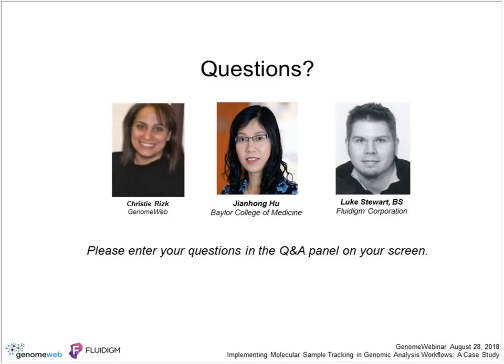And do you provide reference samples for validation? Because the validation is unique to each laboratory, they provide their own validation samples. It's not something that we include in our kits for Advanta Sample ID.